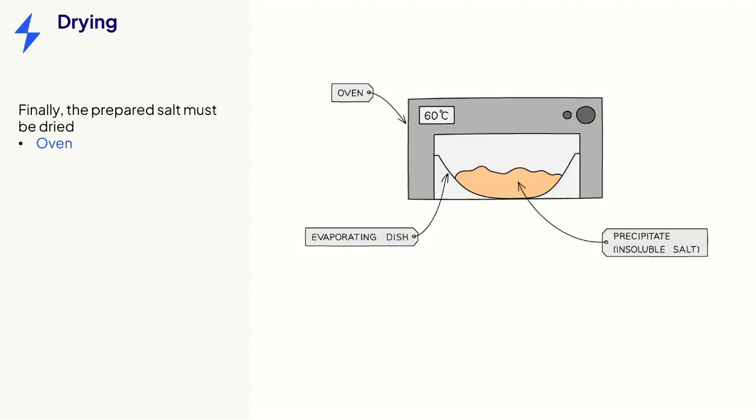The final step is often forgotten about by students. Drying the salt in a warm, dry place is very important. This is best done in a warm oven, as this will evaporate the water.